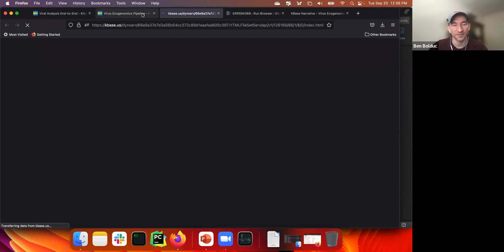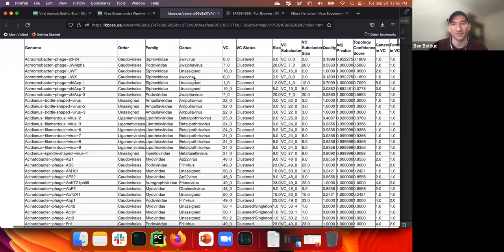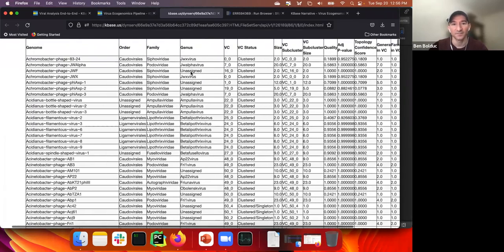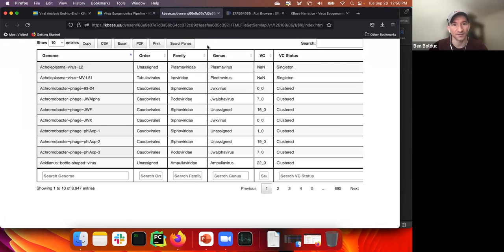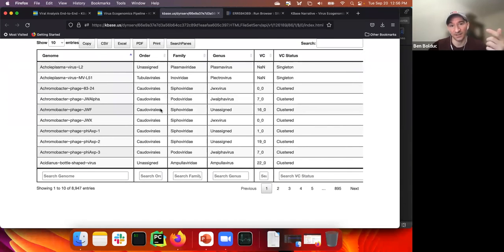Yes, sorry, I actually just clicked on this so that it would open up in a window that you can actually see. And it's loading the CSS style sheets now. Okay, awesome. So that's another cool thing you can do with KBase, is that I can actually have HTML and CSS and all of that in here to make it pretty.